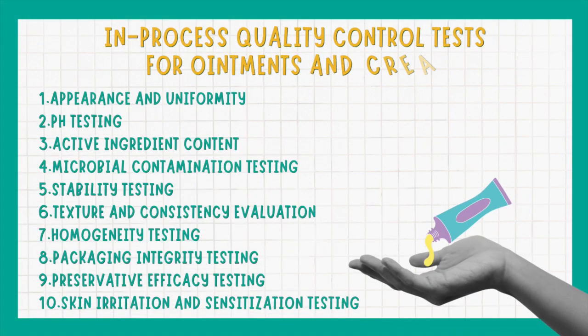In-process quality control tests for ointments and creams: appearance and uniformity, pH testing, active ingredient content, microbial contamination testing, stability testing, texture and consistency evaluation, homogeneity testing, packaging integrity testing, preservative efficacy testing, skin irritation and sensitization testing.